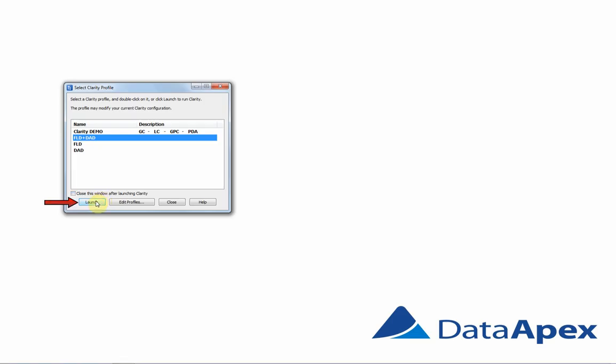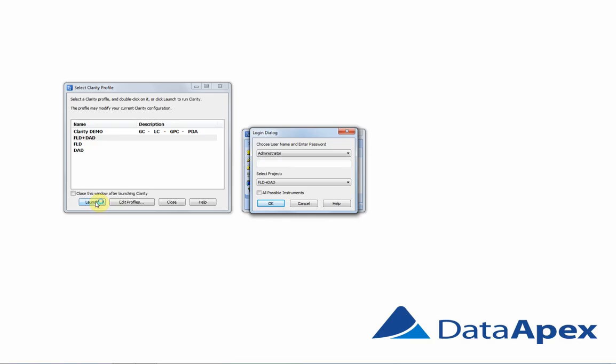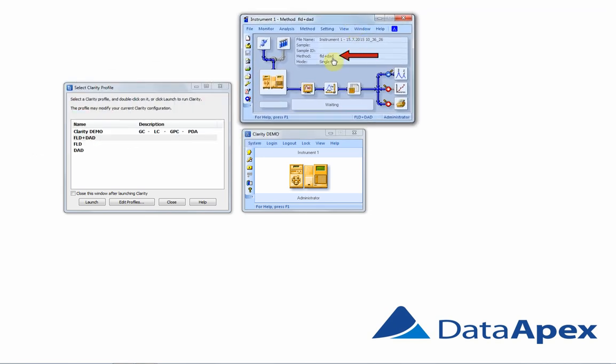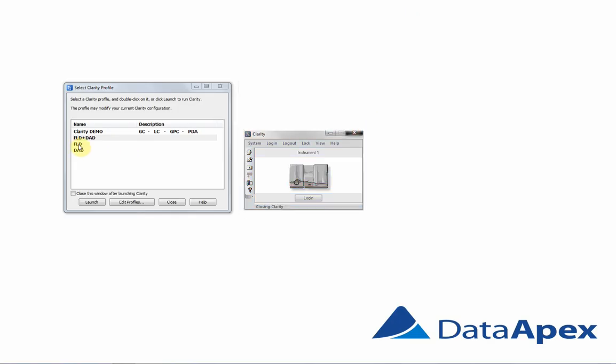Now our profiles are completed and we can test them out. For example, FLD plus DAD, and we can launch it. What should we see is the FLD plus DAD project and the FLD plus DAD method. Now this is working correctly, so I can close it and test the second one.